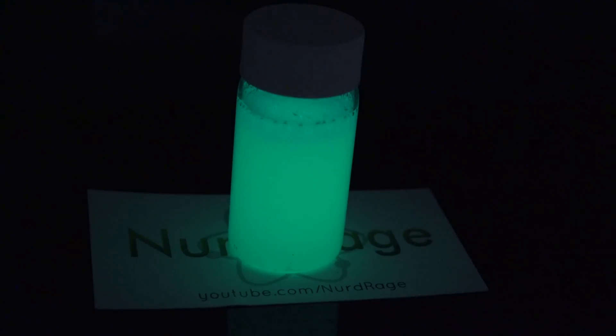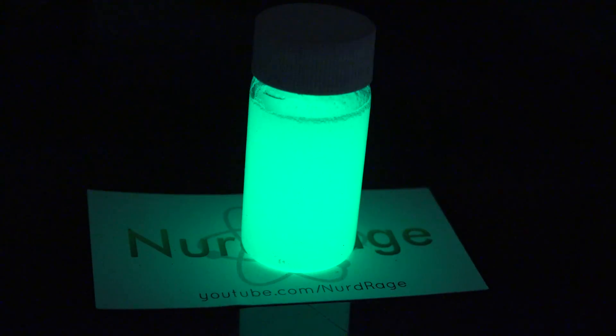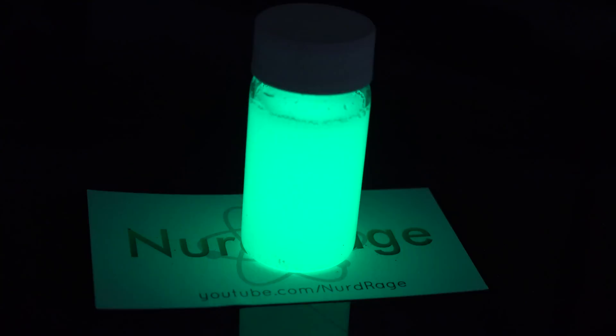There we go — that is a real glow stick reaction. So I guess we learned that organic peroxide doesn't beat hydrogen peroxide as a glow stick activator. Another failure. But if I was already absolutely certain of the outcome, it wouldn't be called research.